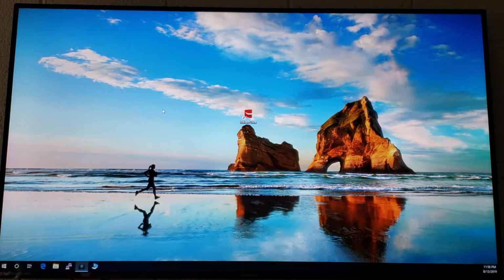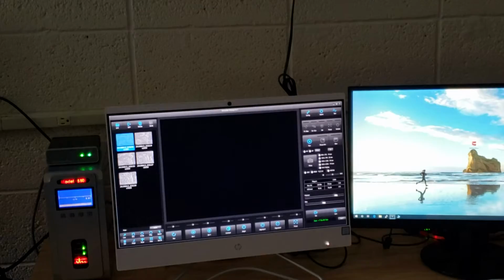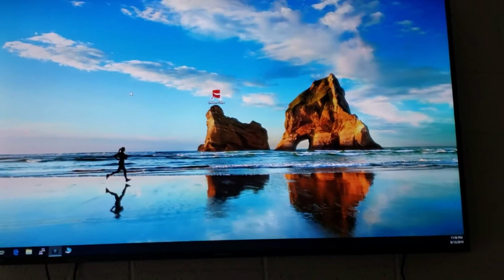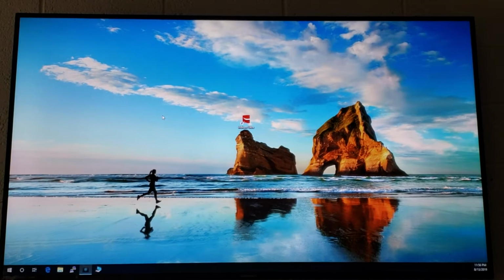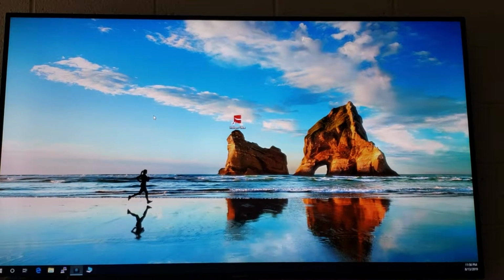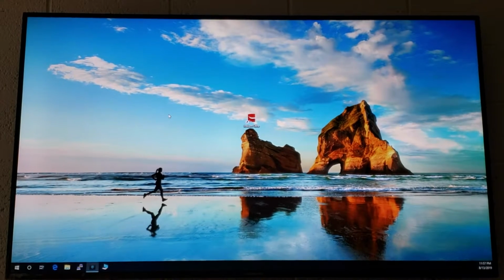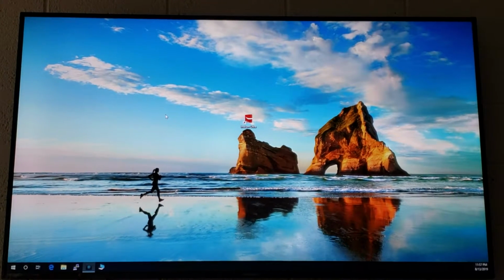When you're doing this for the students, if you want to keep everything on the SEM display, you can keep all monitors as one, instead of just extending the displays, and this way you talk SEM, and then the normal operating will be like this. Keep in mind, we take the images and we drop them over to the IXRF system as well.